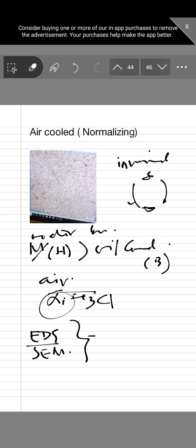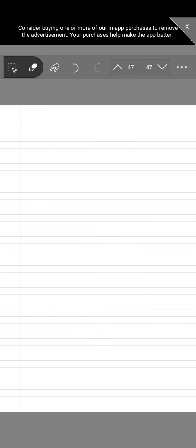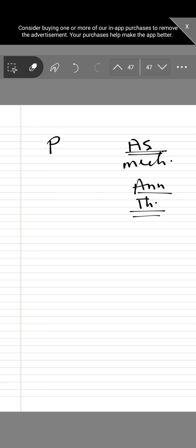Now, another interesting aspect that needs to be discussed is the pearlitic phase. In the as prepared sample and the annealed sample, there are stresses. In the as prepared sample you have mechanical stress, whereas in the annealed sample we have thermal stress. In the as prepared samples, the lamellar structure has formed due to the supply of some external force, so this is how the lamellar structure has taken place.